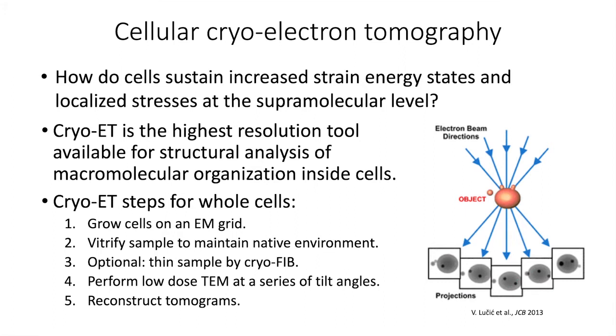In cryo-EM, ice crystals are actually considered a form of contamination, and while you're imaging, these will come across as dark gray or black blobs. The cooling is performed in liquid ethane so that the ice is formed more quickly than crystals can form. So this vitreous ice is actually amorphous.